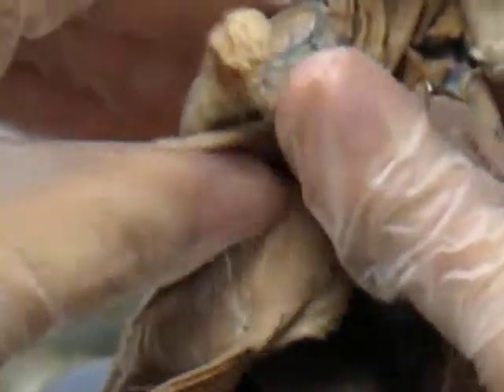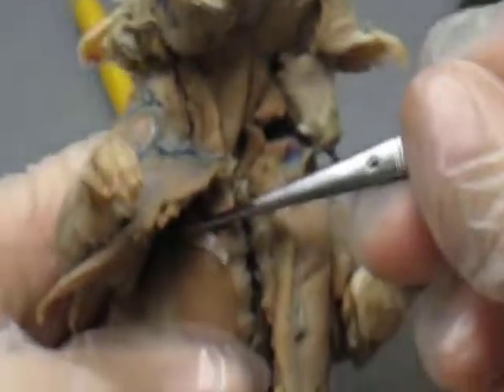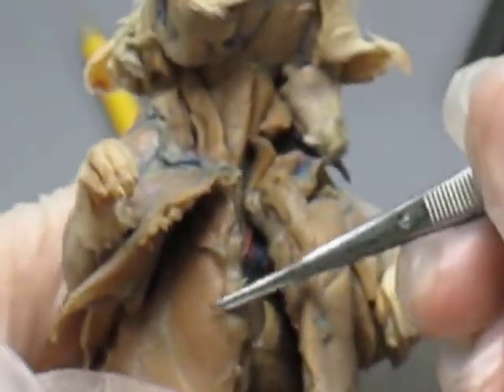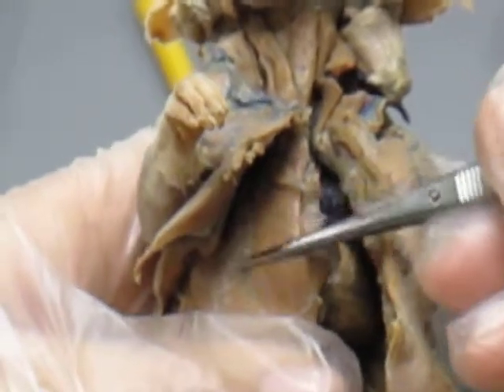Then we move over to lifting up your pectoralis muscle. You have your rectus thoracis, this little thin piece that will come directly across your rectus abdominis, which is this.